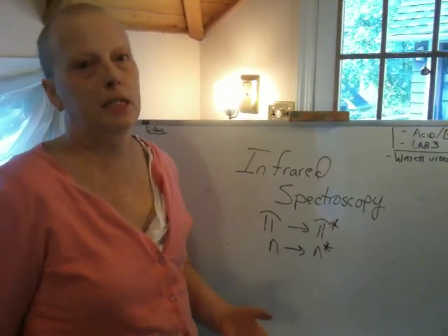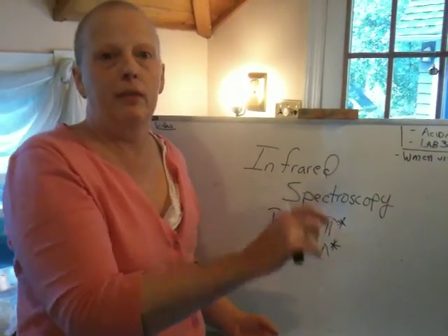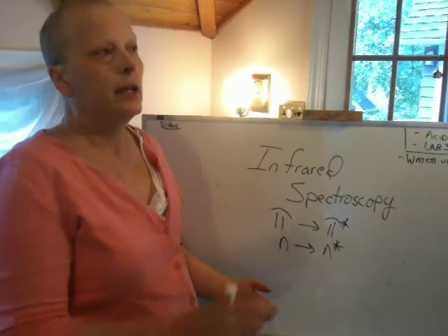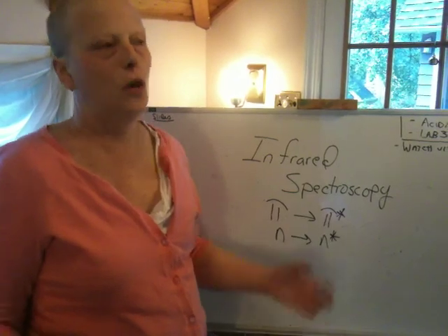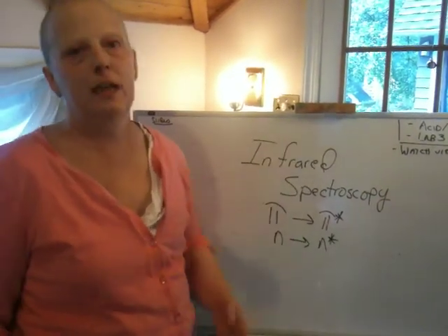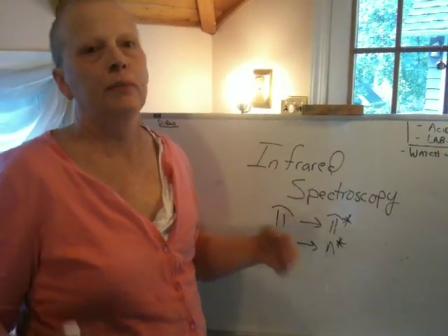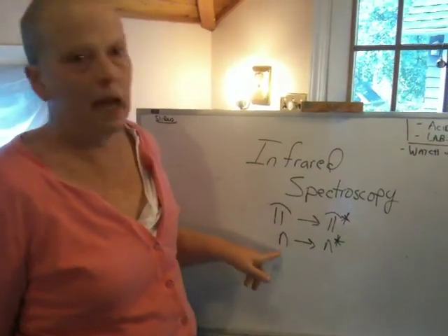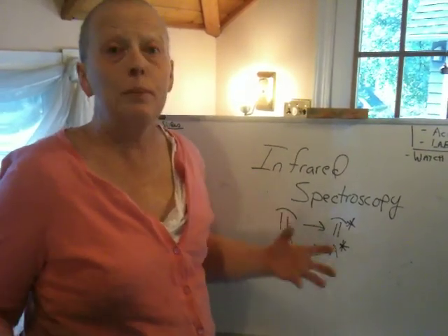Now, what was different about what you did in general chemistry is you weren't really measuring a spectrum. Supposing you had taken that same sample, put it in the Spec 20, and you just changed the wavelength sequentially. And you can do this with UV visible spectrometers. And you actually studied how the sample absorbed UV visible over a range of wavelengths. And you saw different absorptions and different intensities of absorptions that told you about the whole molecule's behavior in UV visible light, like all the pi bonding, all the non-bonded electrons. What are they doing at different wavelengths? That would be a spectrum.